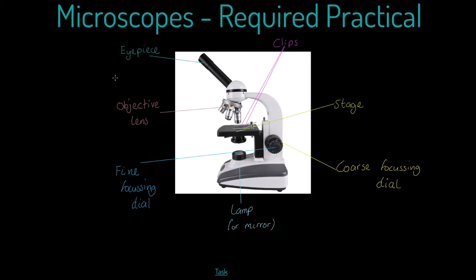Before I get into the task, I want to introduce you to the microscope that you're going to be using. We have our eyepiece with an eyepiece lens, typically 10 times magnification. The other lenses are the objective lenses, and here we typically have three. Very likely they're going to be four times magnification, 10 times magnification, and 40 times magnification.